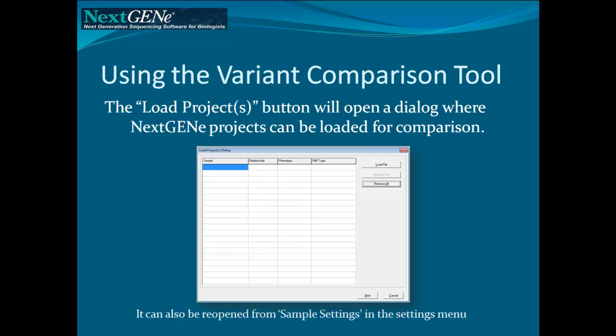The Load Projects button will open a dialog. Projects are then loaded one at a time. This dialog can also be reopened from the Sample Settings option in the Settings menu after the comparison has already been run.